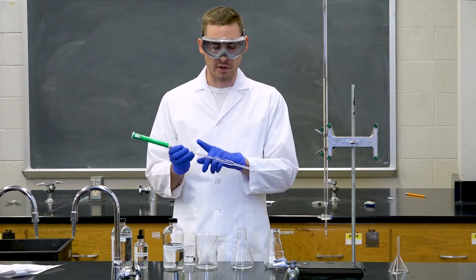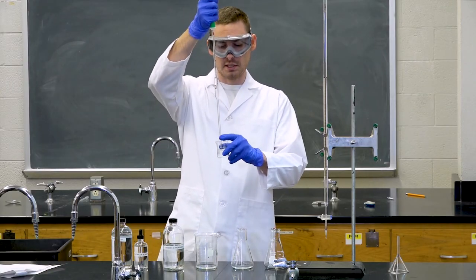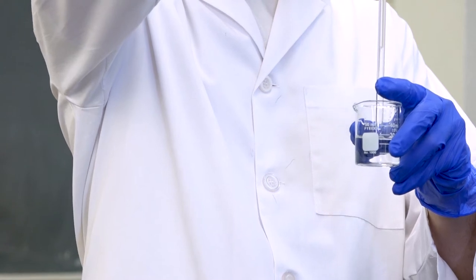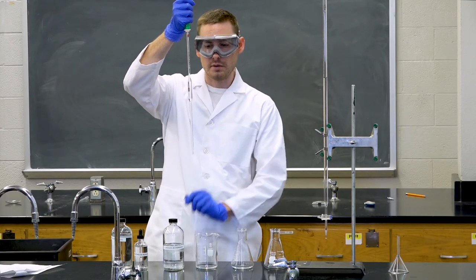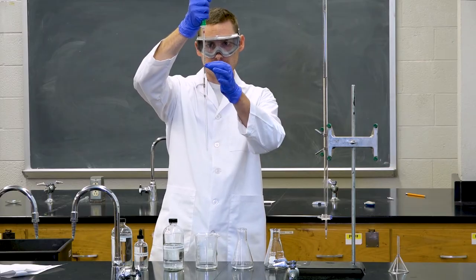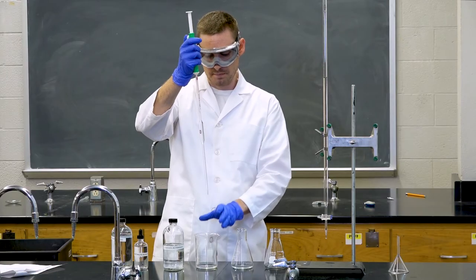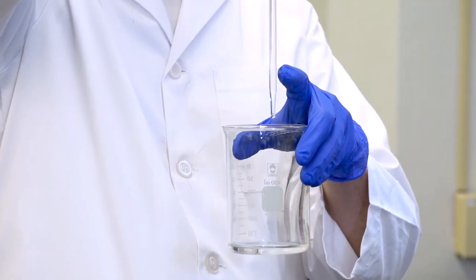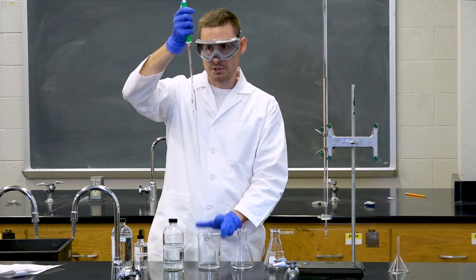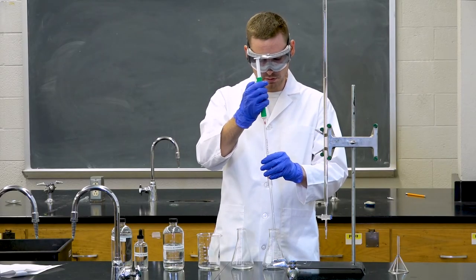Once you have rinsed the volumetric pipette 3 times, you can then draw up your solution until it reaches the line that is just above the bowl. If you overshoot the line, make sure that you discard the extra drops into a waste beaker and not into your solution, so that you do not contaminate it. Once you have reached the line, we can then add that into our Erlenmeyer flask for the titration.